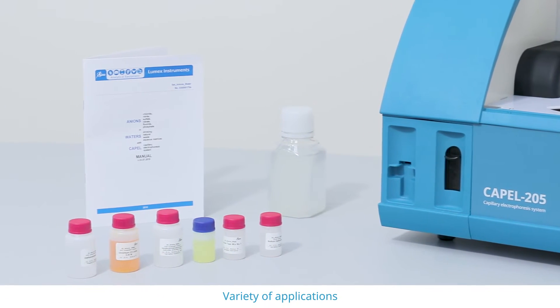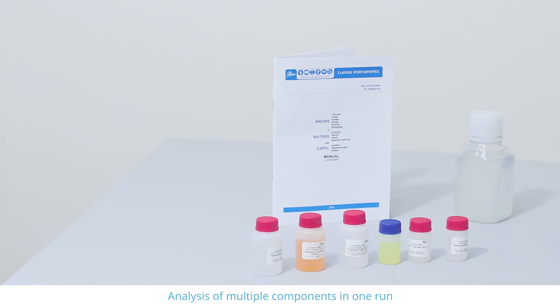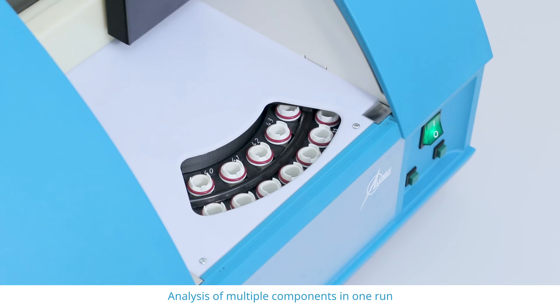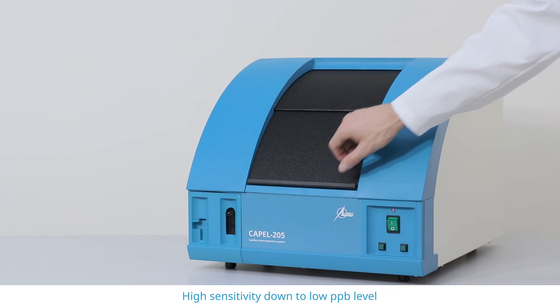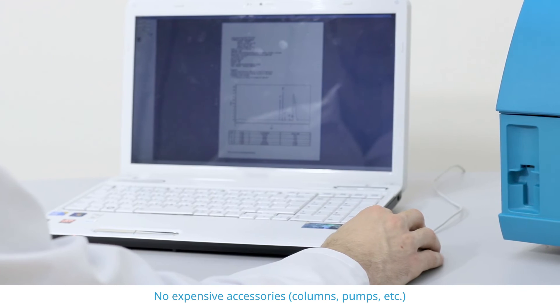CAPEL 205 is a universal instrument capable of performing any types and modes of CE analysis. It provides you low-cost, simple, fast, and accurate measurements in a great variety of application areas.